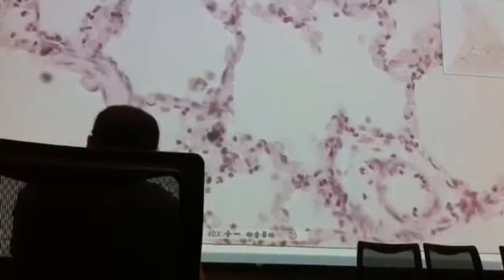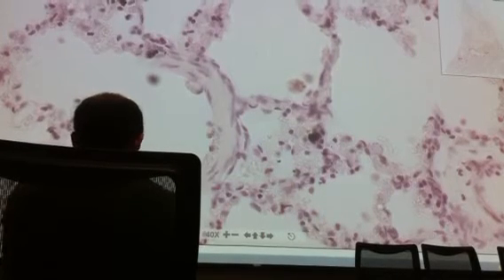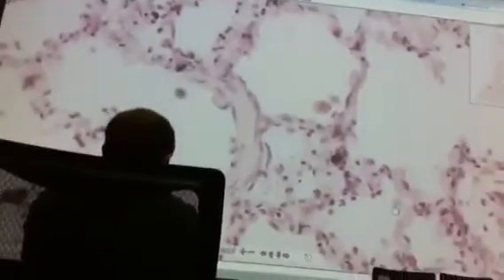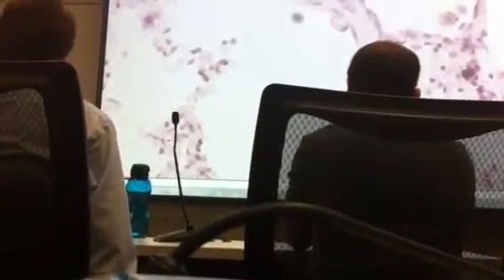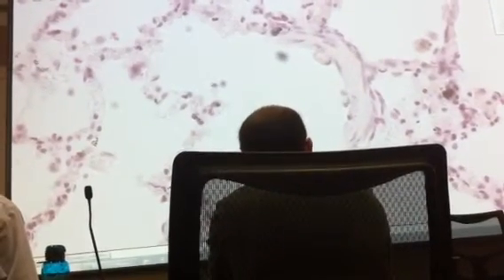And then you're going to have some macrophages on the surface kind of wandering around. And see these glassy appearance structures? Those are actually the red blood cells within the capillaries, so that's where the capillaries are. So here's a nice macrophage here. Sometimes you'll see this kind of stuff. This is actually carbon deposits within the lungs. Sometimes you'll see those in the macrophages, because part of their job is to take that up. So you may see something like that. So look around that one.